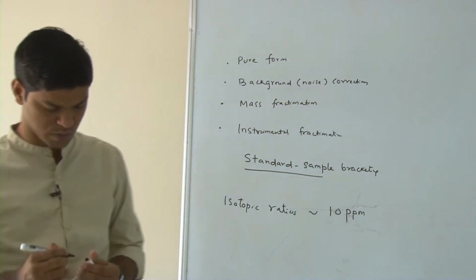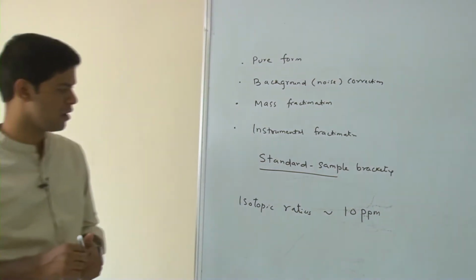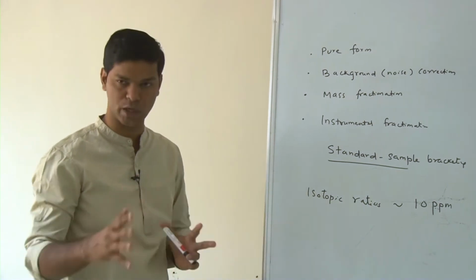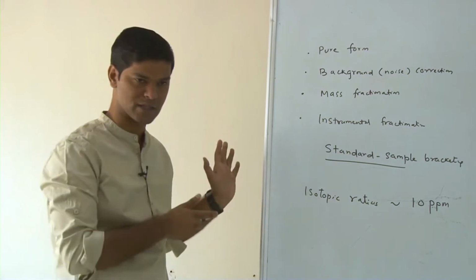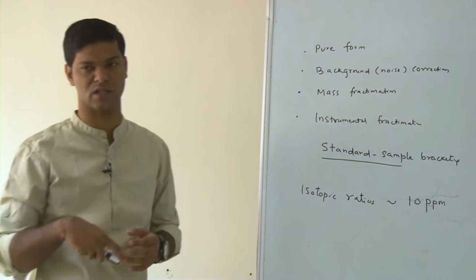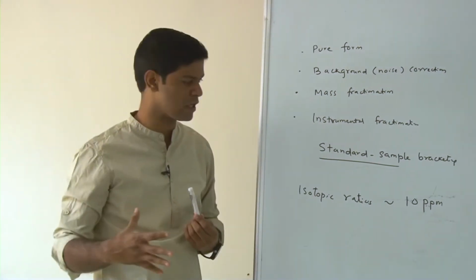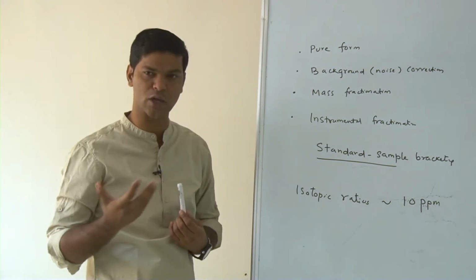But most of the time, particularly when you are interested in the geochronology part of it, we are also interested to know the concentration of the same sample. Let us say you are measuring rubidium or strontium, you can measure the isotopic ratio in a mass spectrometer, but you also need for your scientific purposes the concentration of that, and a mass spectrometer does not give you that concentration term, mainly because during the processing you lose quite a bit of sample and you cannot quantify that.